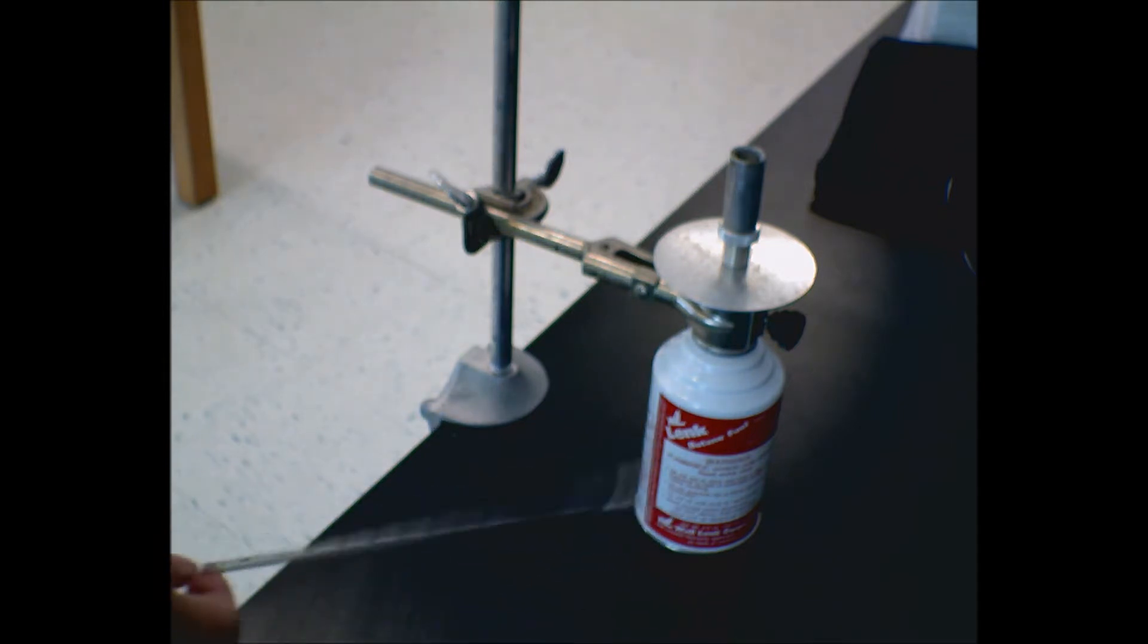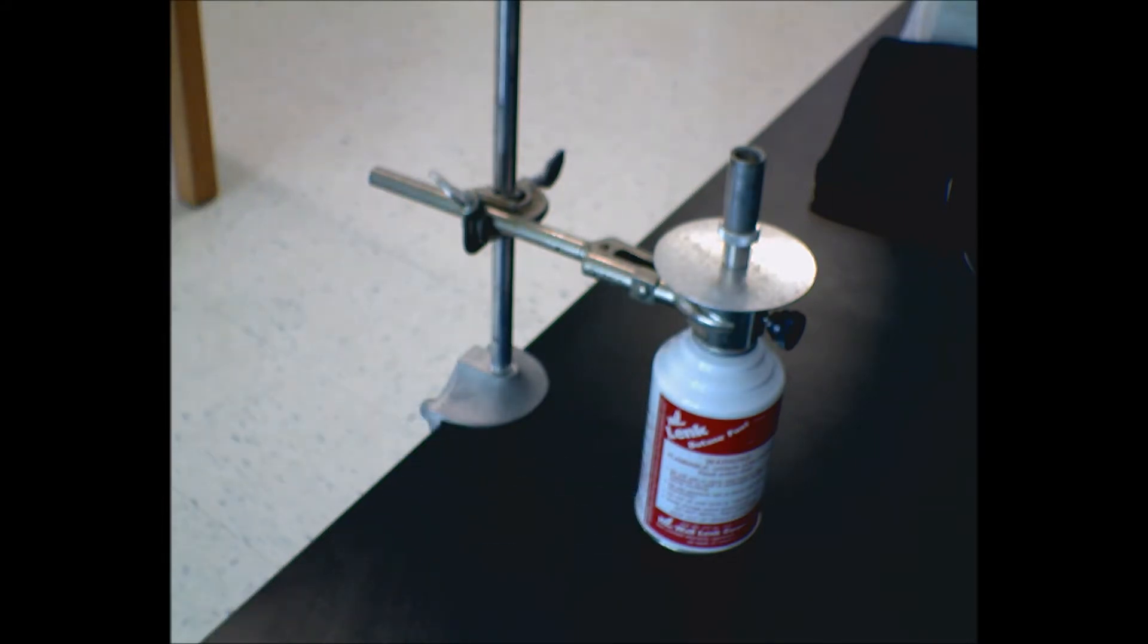So we have a can of flammable gas, it's butane, so it's not quite the same as the stuff that comes out of the front desk demo or in the chem lab next door. That's methane, this is butane. This would be the stuff that's in cigarette lighters. It will still burn and it will get pretty hot.